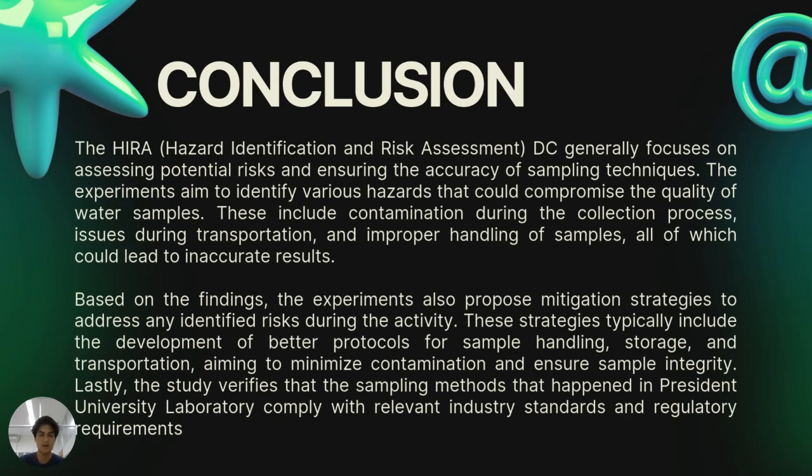Based on the findings, the experiments also propose mitigation strategies to address any identified risks during the activity. These strategies typically include the development of better protocols for sample handling, storage, and transportation, aiming to minimize contamination and ensure sample integrity. Lastly, the study verifies that the sampling methods in the President University laboratory comply with relevant industry standards and regulatory requirements.